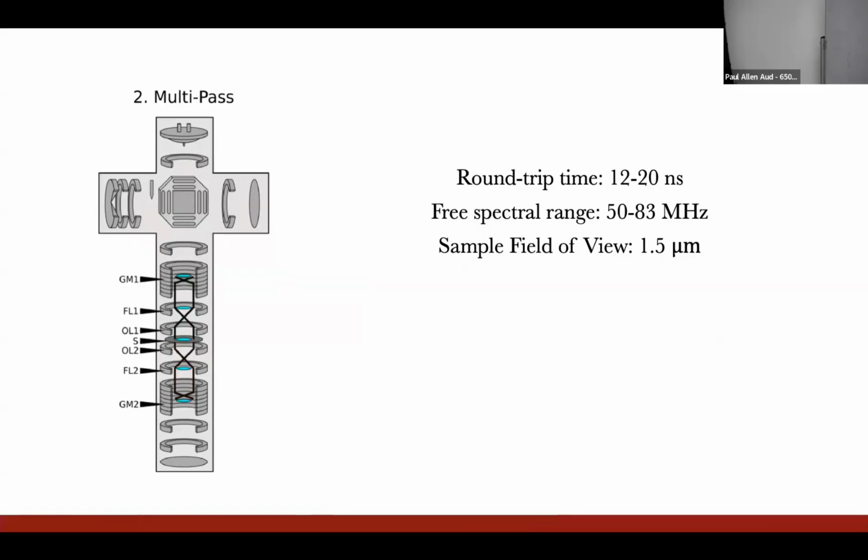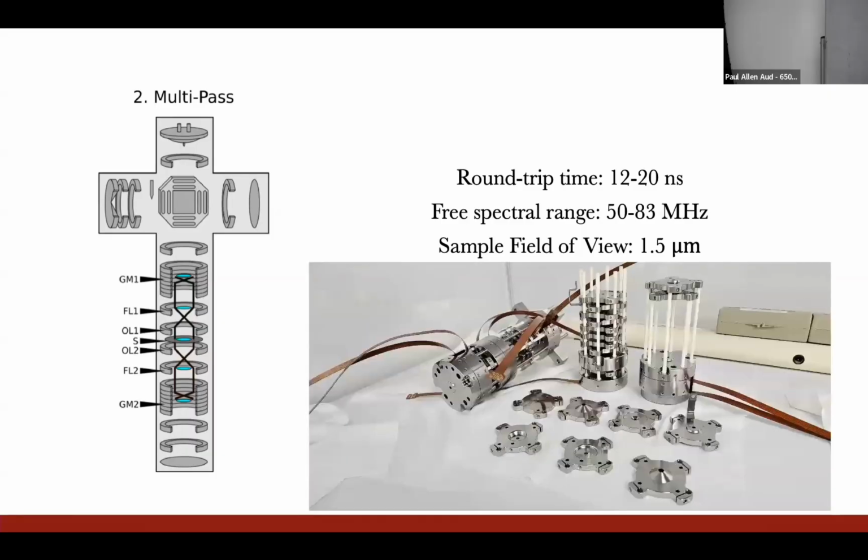And when I do an electron measurement, we're going to get magnifications on the order of a few thousand. So that puts this field of view right onto the size of your camera chip and will give us few nanometer imaging resolution, which would be inaccessible in optical microscopy, of course, without something like a more complicated super resolution technique. Now, let me tell you about loss in these systems, right?